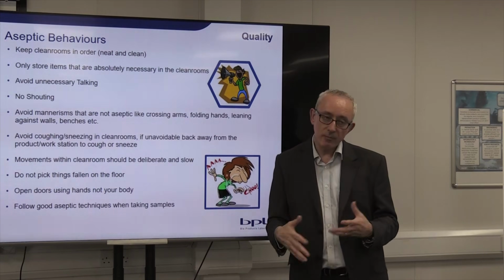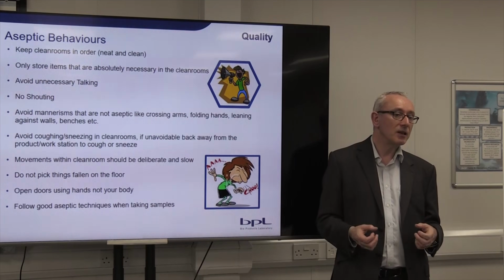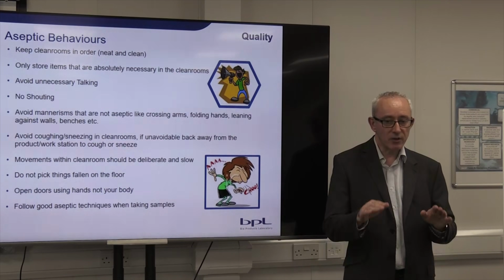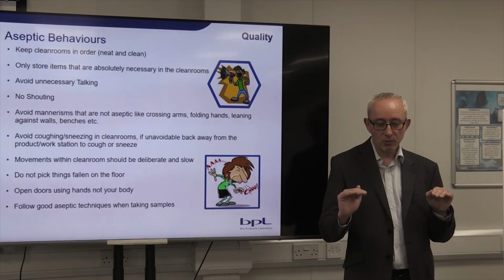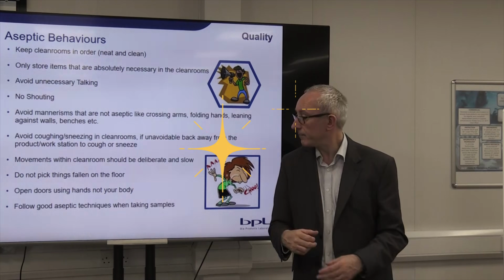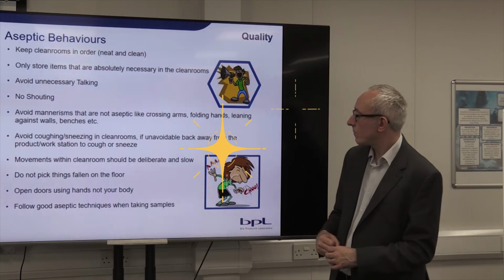The other thing, if you drop something onto the floor, then you need to leave it to the end of the shift or the end of the session. Most of the contamination will have settled onto the floor. So it goes on the floor, just leave it until the end of the time.